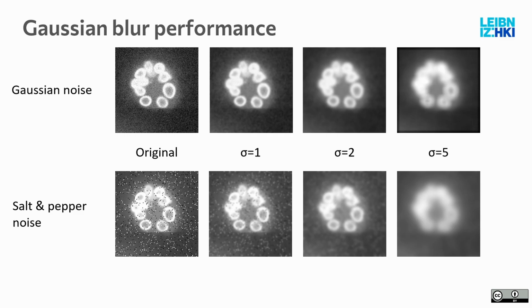It's similar to the box filter, so it blurs everything to hell. And now here it's sigma, because it is basically using the Gaussian sigma as its main parameter. It still cannot handle salt and pepper noise very well, but you see here that if you compare this a bit, it's less blocky. So I think I have here a comparison with everything.